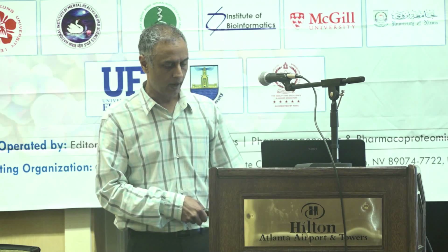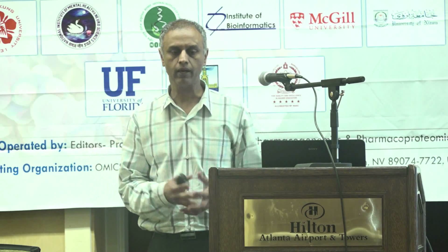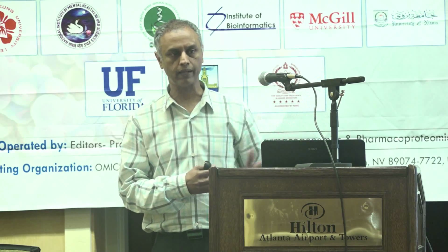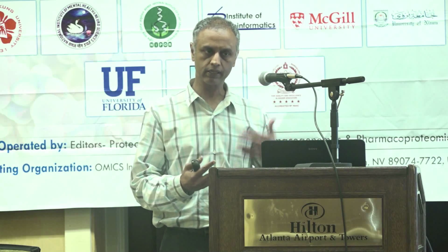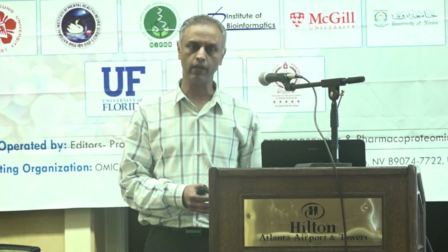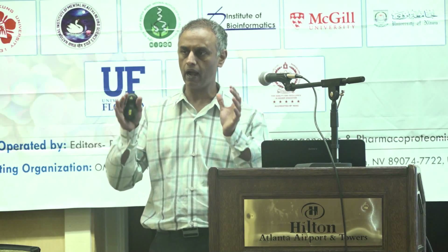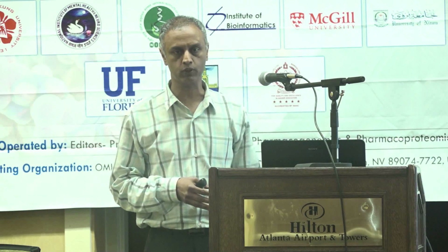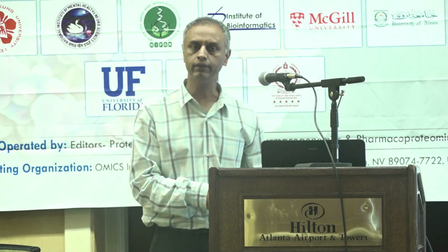And I have to admit that for many, many years, I avoided this area of research in our lab because the whole time, it was just too easy. The bar was so low. Because we are trying to conquer cancer proteomes, this is nothing for a proteomics lab. But given that it has still not caught on in a clinical setting, we decided that we are going to push the envelope to show proof of principle that this can be done in a clinical framework. And now we are working with manufacturers of these mass spectrometers to say, how can we take your instruments into a clinical setting? Because I think they need this help.